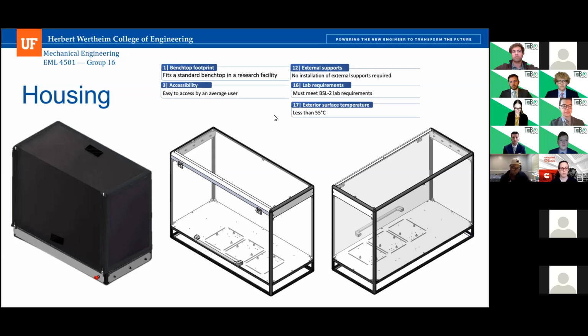And then as you can see in the picture on our left, we also have a polyvinyl fabric cover to protect experiments from the photo-bleaching effect and not interfere with any fluorescent intensity or optical density measurements. And this is a really nice, cheap option that's easy to sanitize in a laboratory setting.